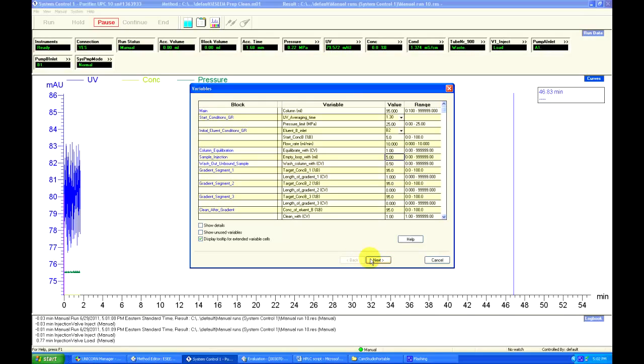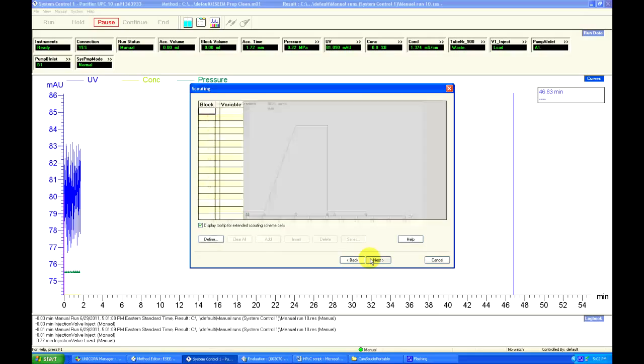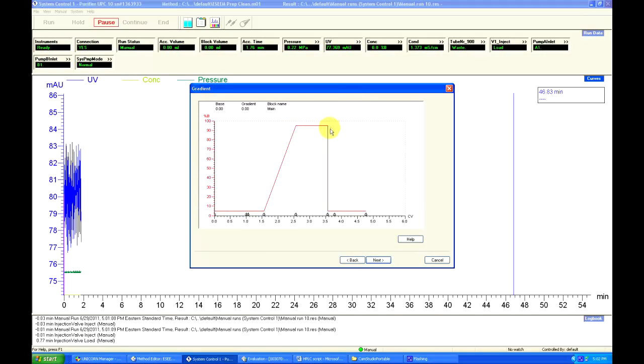Clicking Next two more times shows us the Gradient window. This simply displays what sort of gradient the selected method runs, with %SolventB on the y-axis. In this case, a linearly increasing gradient is used, but other gradients can be created with different slopes of increasing solventB to take advantage of a known elution time of a specific peak.